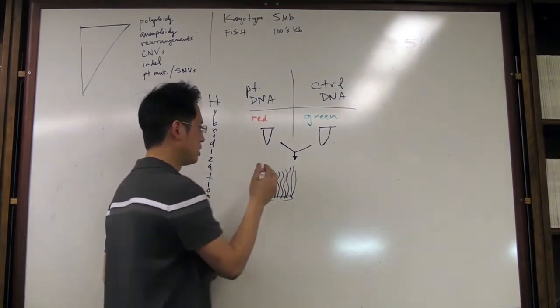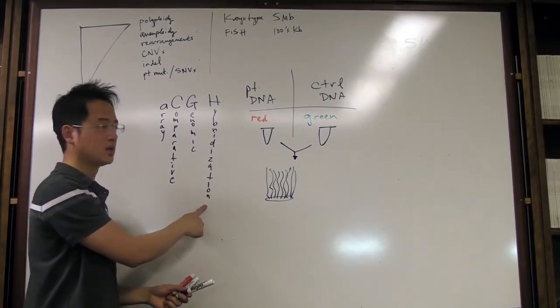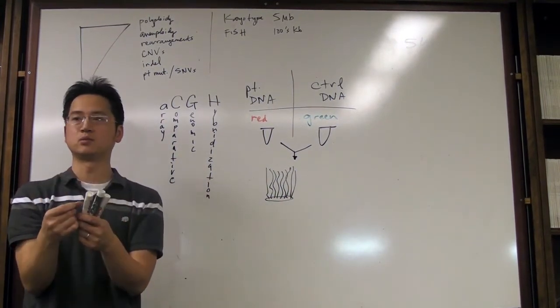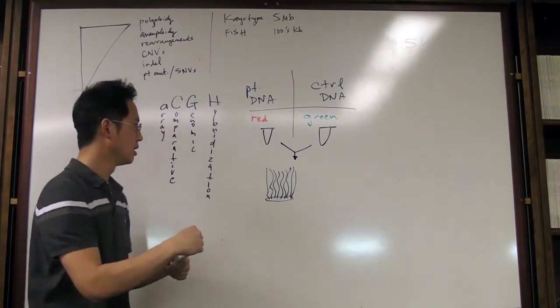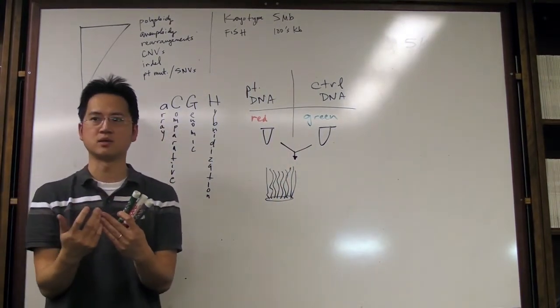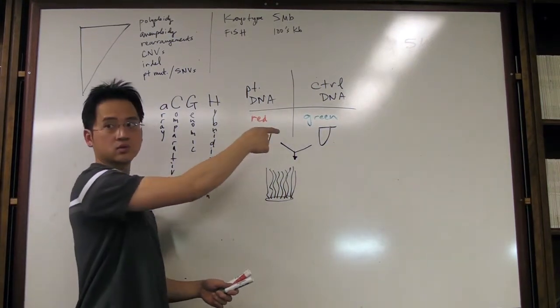And what you allow them to do is allow them to hybridize. So here's the hybridization step. You allow them to hybridize to the target DNA on the spot on the chip. One of those 180,000 spots that are on there. So during this process, what is happening is that the mixing of the two samples allows a competitive environment for you to do comparison between the patient versus control.